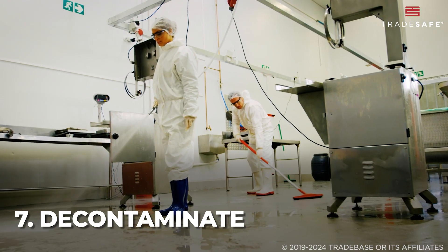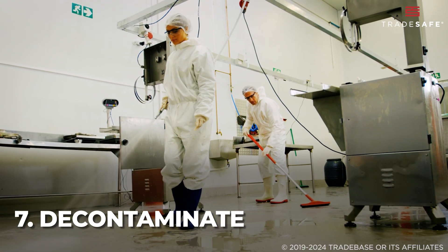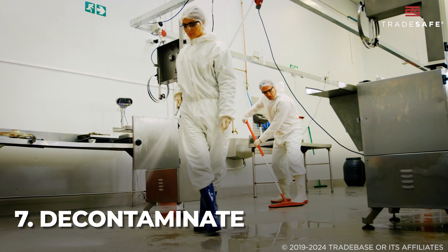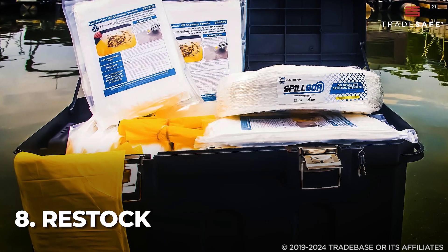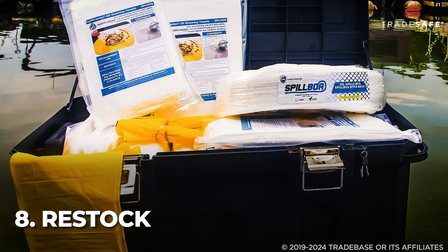Next, decontaminate. Clean the affected area thoroughly using appropriate methods for the spilled substance. Lastly, restock all used items in the spill kit to ensure readiness for future incidents.